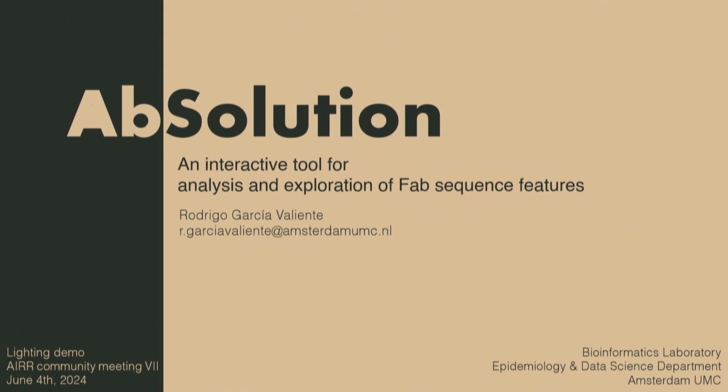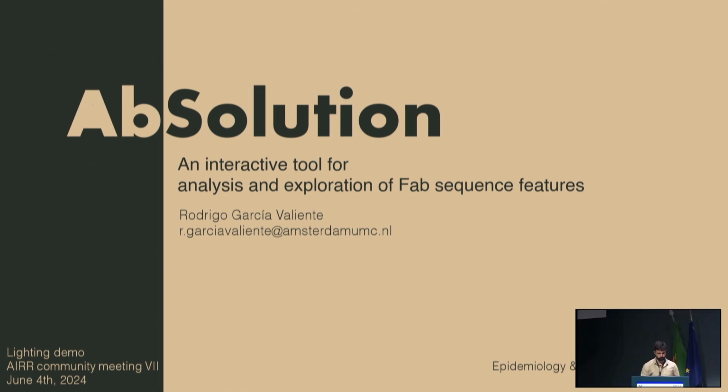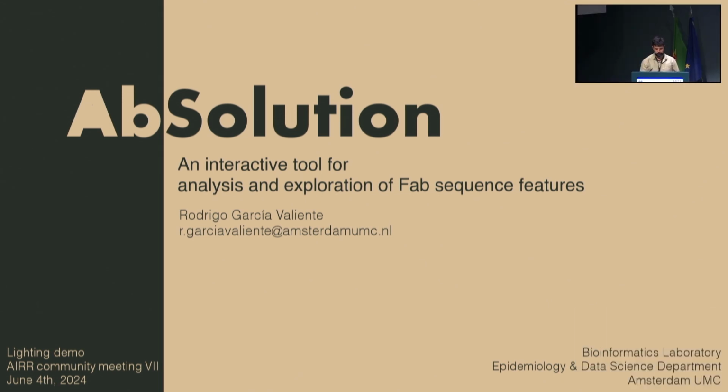I will talk today about AbSolution, which is an interactive tool for analysis and exploration of FAB sequence features.